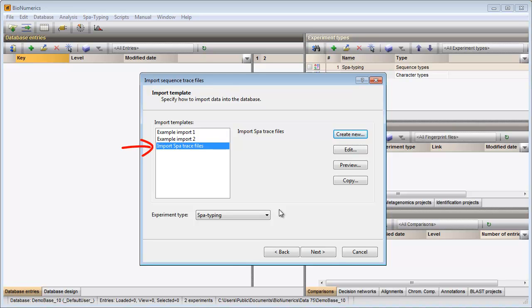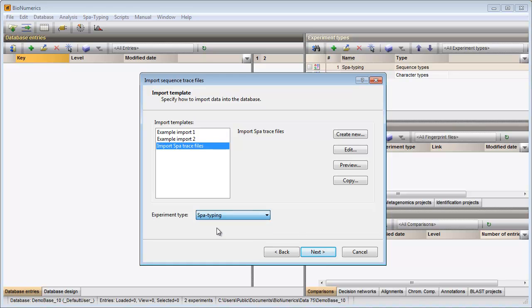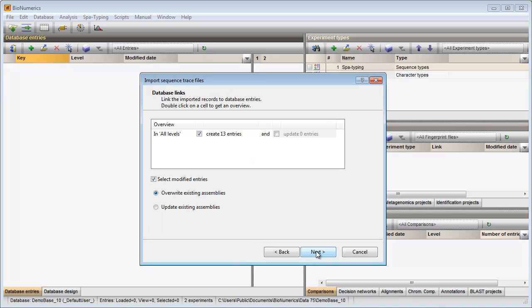I make sure my template is selected and select spa typing as my experiment type and press next to go to the next step. I confirm the creation of the new entries in the database and I go to the final step.